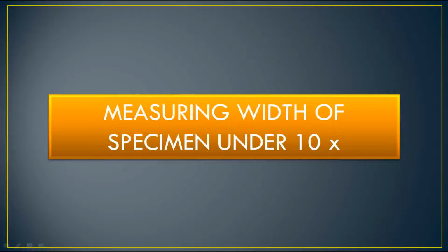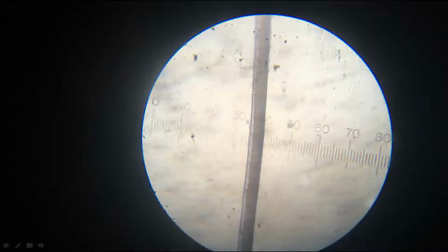We are going to measure the width of a specimen under 10x. For that, we need to remove the stage micrometer from the stage of the compound microscope, keeping the ocular inside the eyepiece. In another slide, here we took a hair. We placed that hair on that slide and kept it under the microscope. Under the microscope, we can see the hair's width in this way.